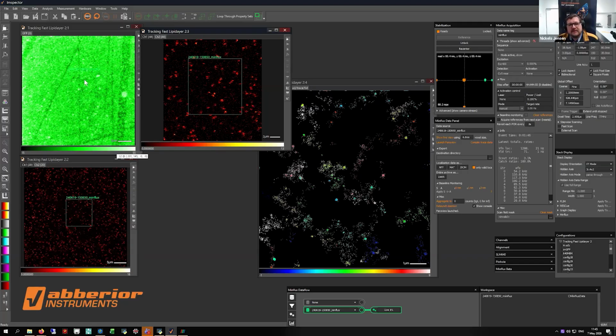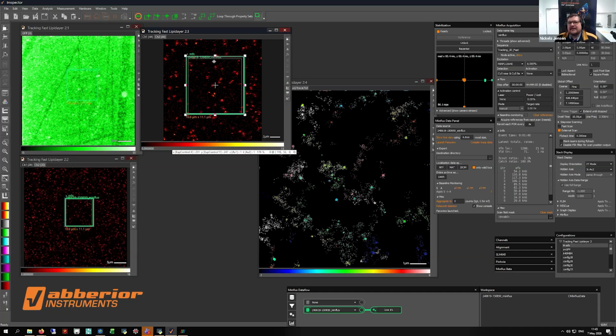It's just a layer, and in this layer, there are single red dots that diffuse freely, somehow freely. It looks like this. If I had taken that image, I would just decide for a region I'm interested in, define this as my MINFLUX region, and then take the sequence I need. Instead of an imaging sequence, I would choose a tracking sequence, and there are different tracking sequences: tracking in 2D very fast, tracking in 2D for slower events, and also tracking for 3D events, so for diffusion in 3 dimensions.